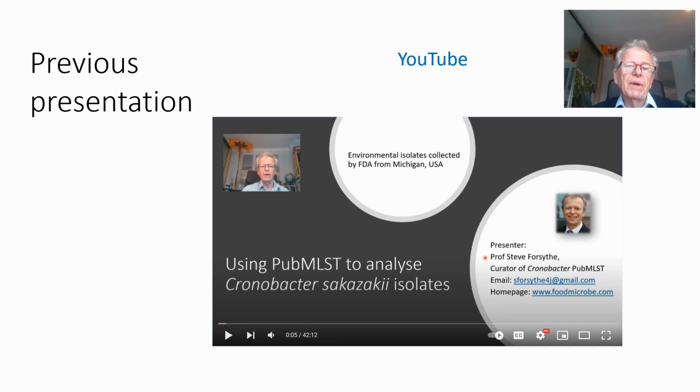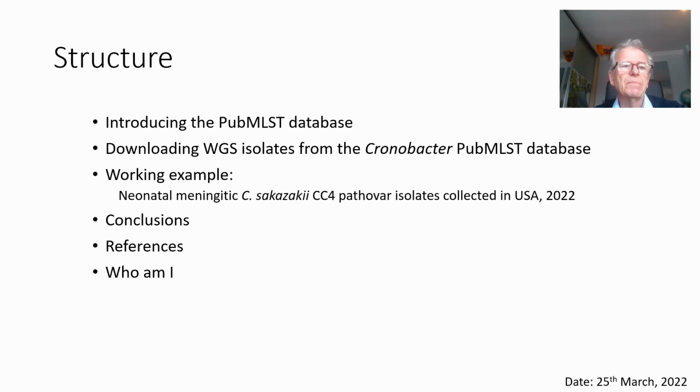In order to understand more about PubMLST and looking at Cronobacter sakazakii and taxonomy, I would advise you to go to YouTube and see the one which I did there a few weeks ago, which will give you that background, and I won't be overlapping very much with that one in this slide presentation.